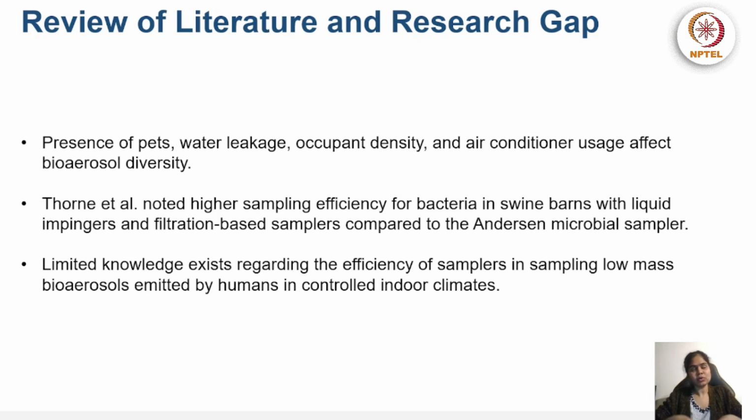In indoor also, compared to the outdoor environment, the indoor environment is considered a low biomass environment. When I say indoor environment, I am not talking about the places which are rich in diversity or rich in sources. I'm talking about a normal household with two people. It's a normal indoor environment with low biomass. So if I go to a house and do some sampling, that might not represent the other scenarios. So it is really important to know how efficient a sampler is in such low biomass environment conditions.